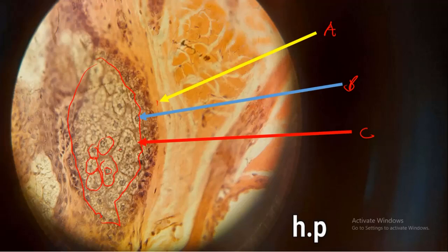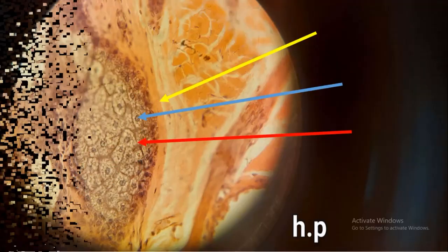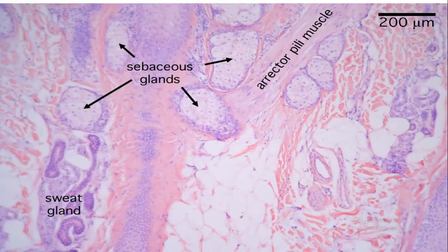And for the whole of this slide, in some exams they will ask you to name the slide. In this case, this is the sebaceous glands, and the whole of this slide is simply the scalp. Please take note of that and make sure that you understand.